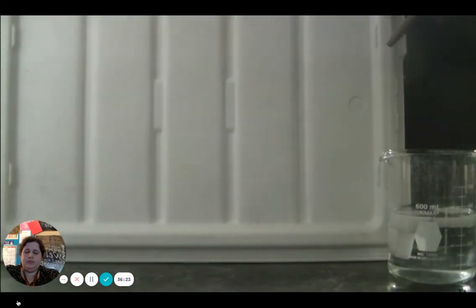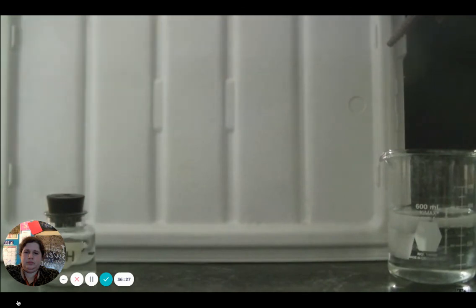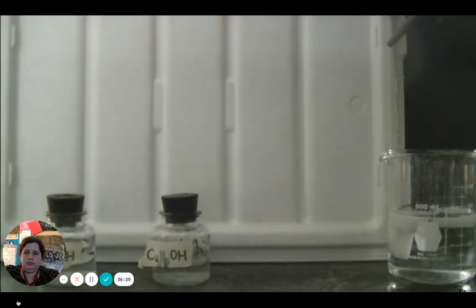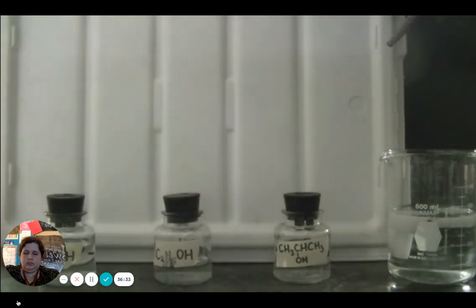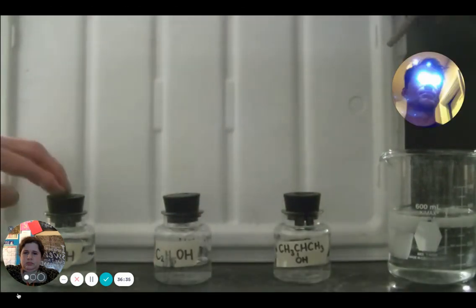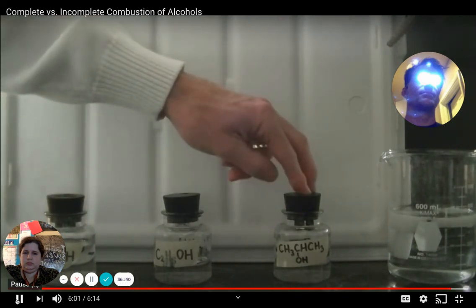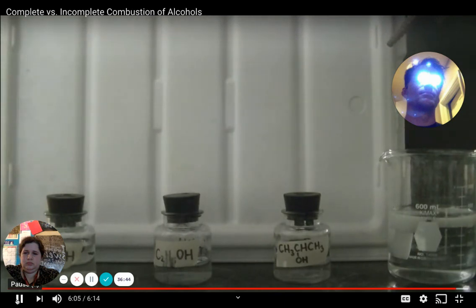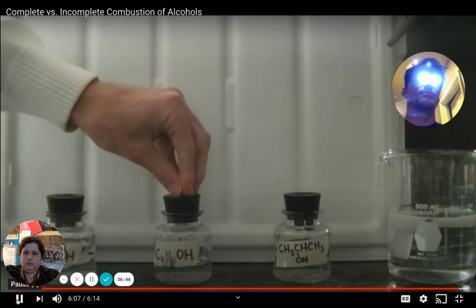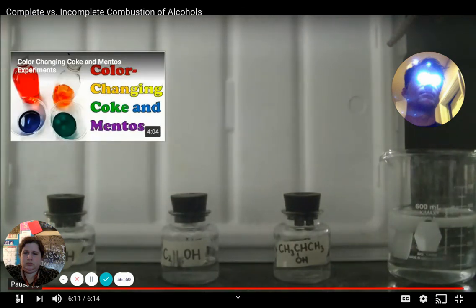In summary, what you basically see as you go from a 1 to 2 to a 3 carbon alcohol is that the lower the number of carbons in the alcohol, the more completely it combusts, and the greater the number of carbons in the alcohol, the more incompletely it tends to combust. The 2 carbon alcohol ethanol showed signs of both complete and incomplete combustion.